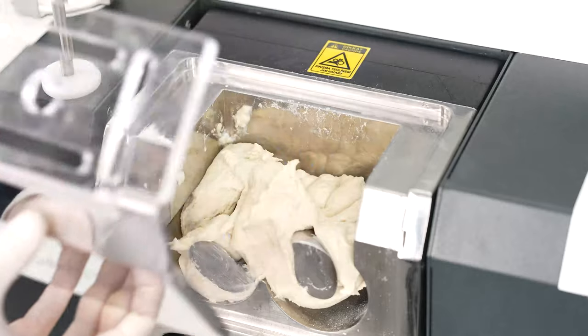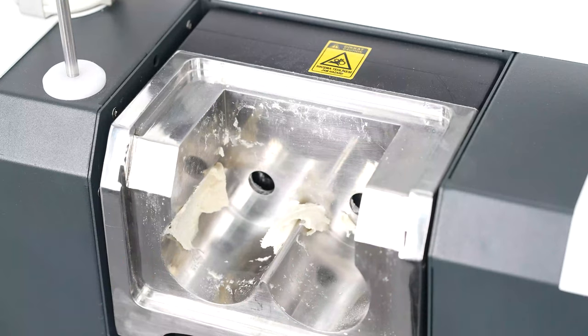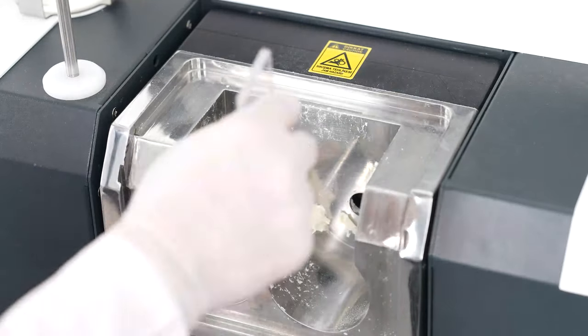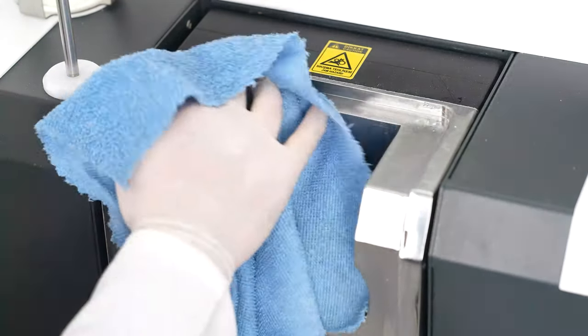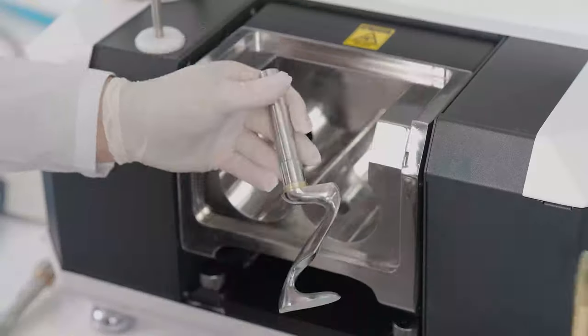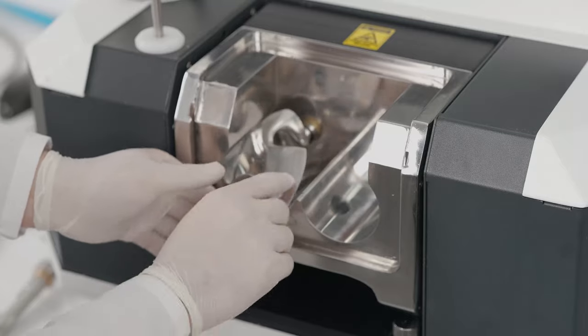After the test, the kneading unit cover and kneading blades are removed. They are cleaned with a wet sponge and dried with a cloth. The kneading blades are then paraffinized with liquid paraffin and placed back in their slots.